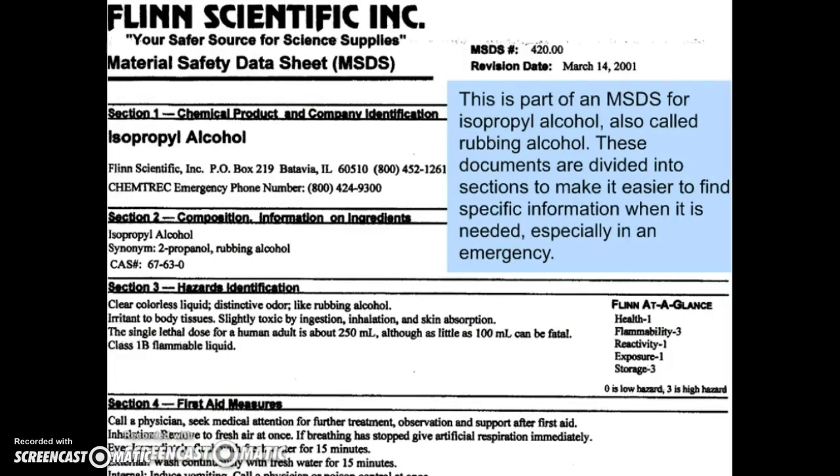And our last page is an example of an MSDS. This is for isopropyl alcohol. That's, in other words, called rubbing alcohol. That's the stuff that you would put on before you get a shot. You'd rub it on your skin. The stuff you put on like a wound to make sure you get it clean. That's rubbing alcohol. Isopropyl.